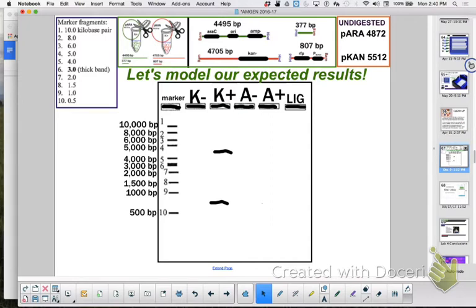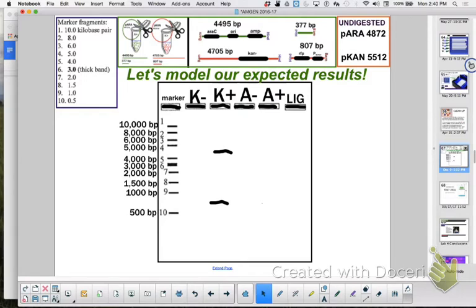Now K minus isn't going to travel like that because the minus means we didn't add any restriction enzymes. So this should be whole plasmids. But do all whole plasmids travel the same way? No. Because we know that the super fast ones are the ones that are super coiled and they're going to move super fast, almost as fast as a fragment would, because it can move easier through the matrix of the gel, the sugar matrix.